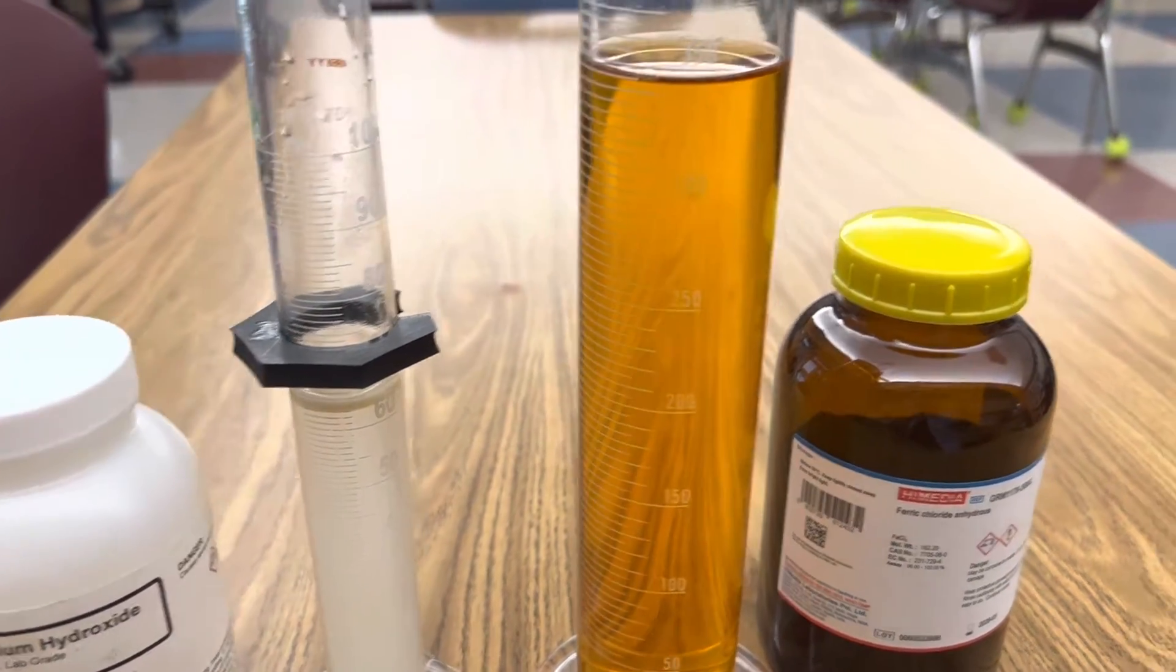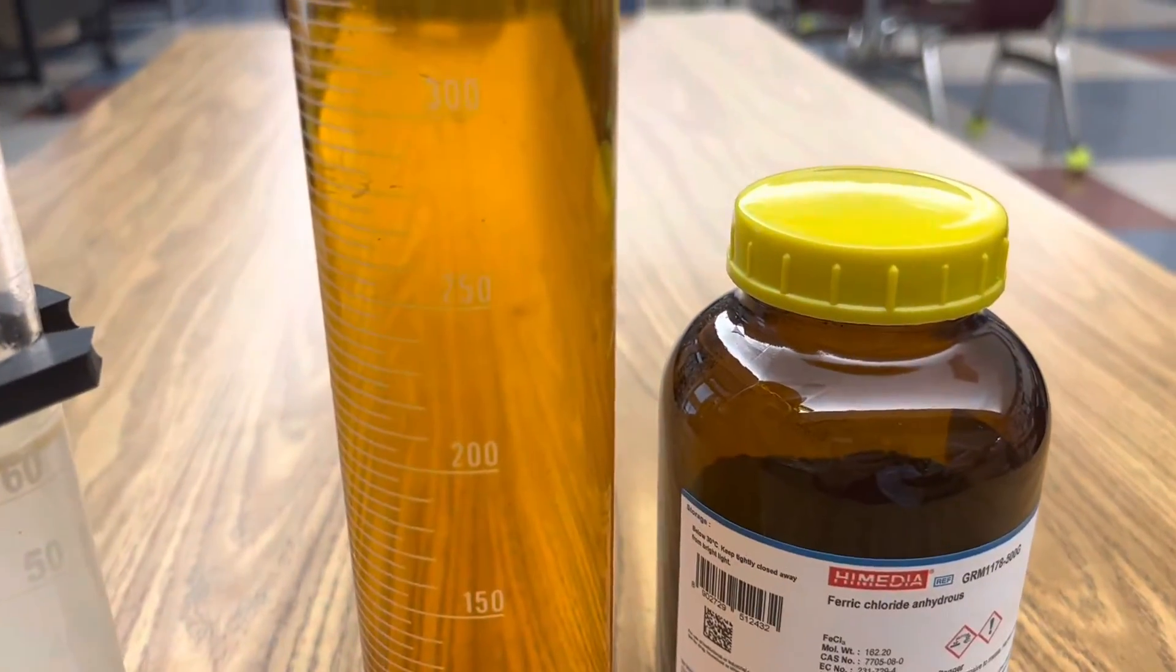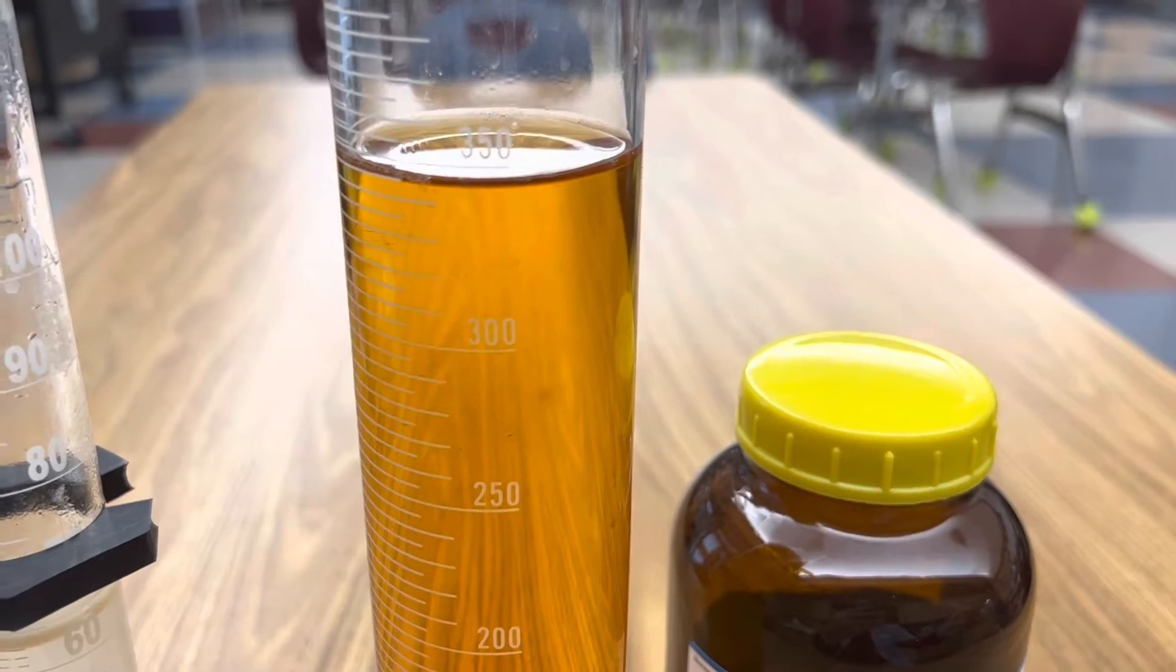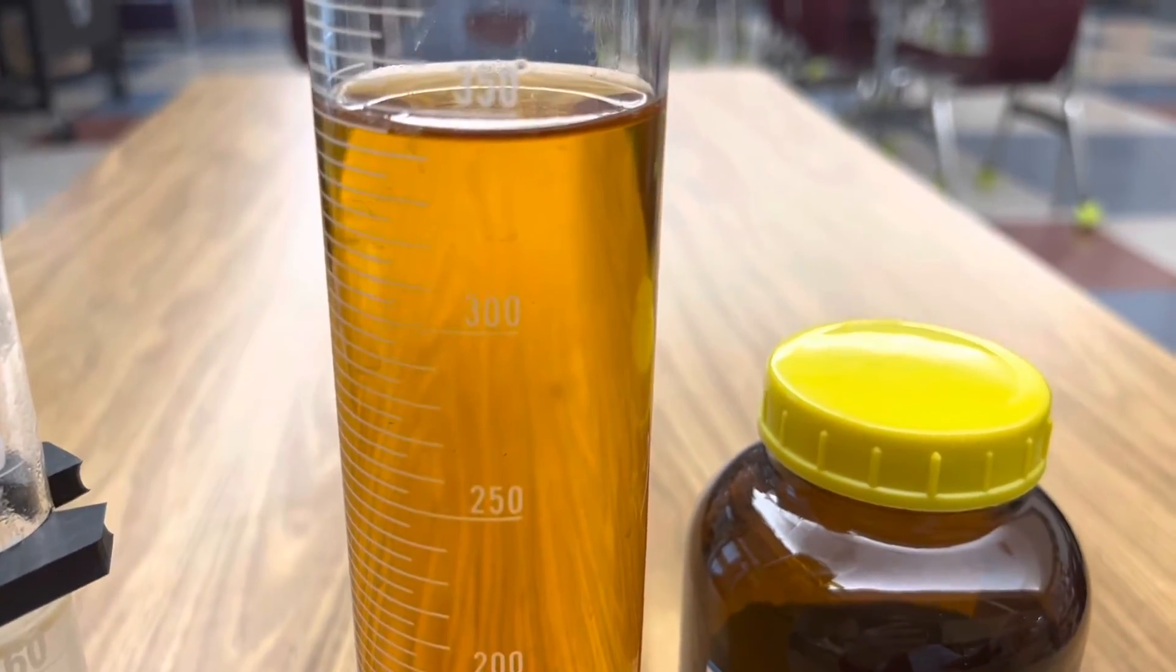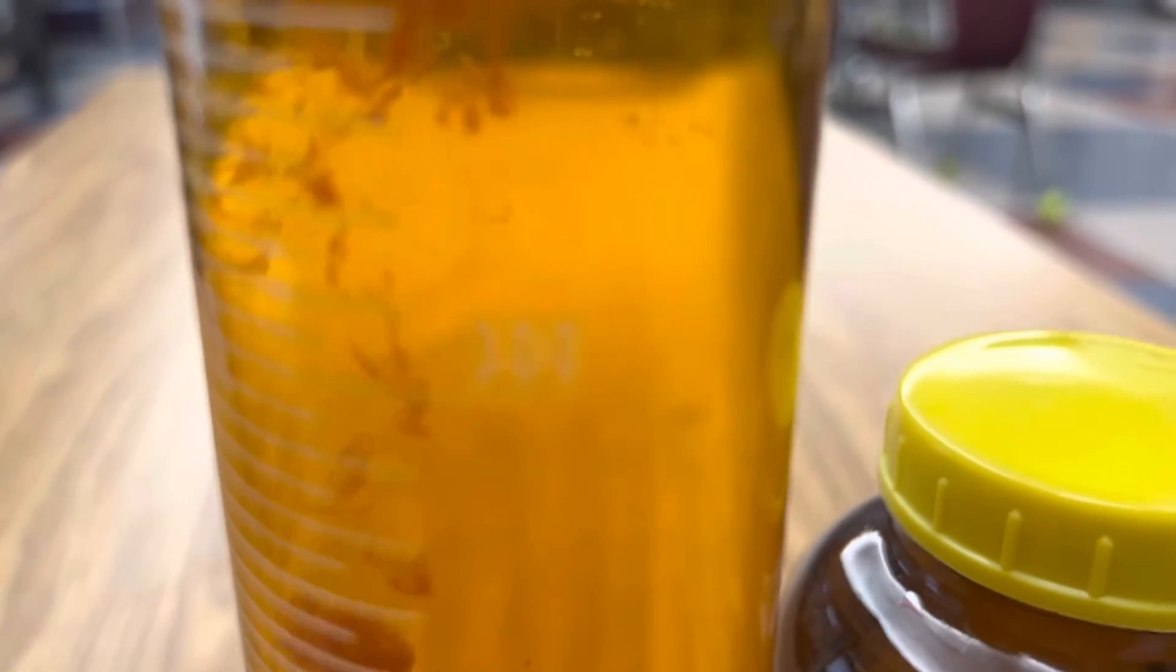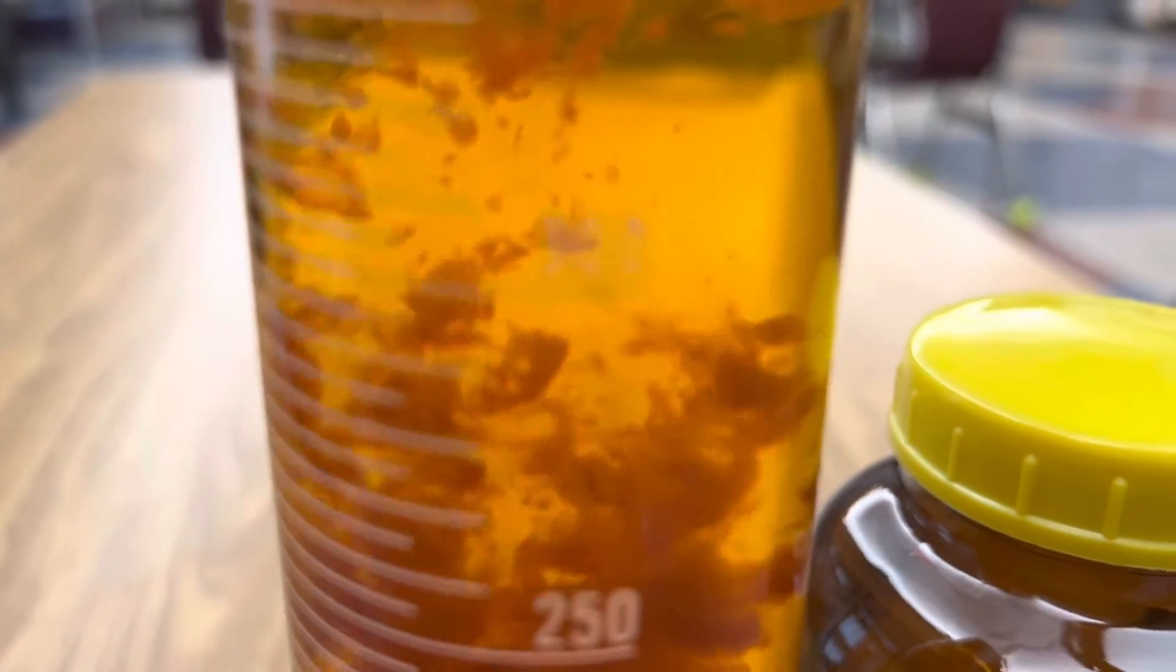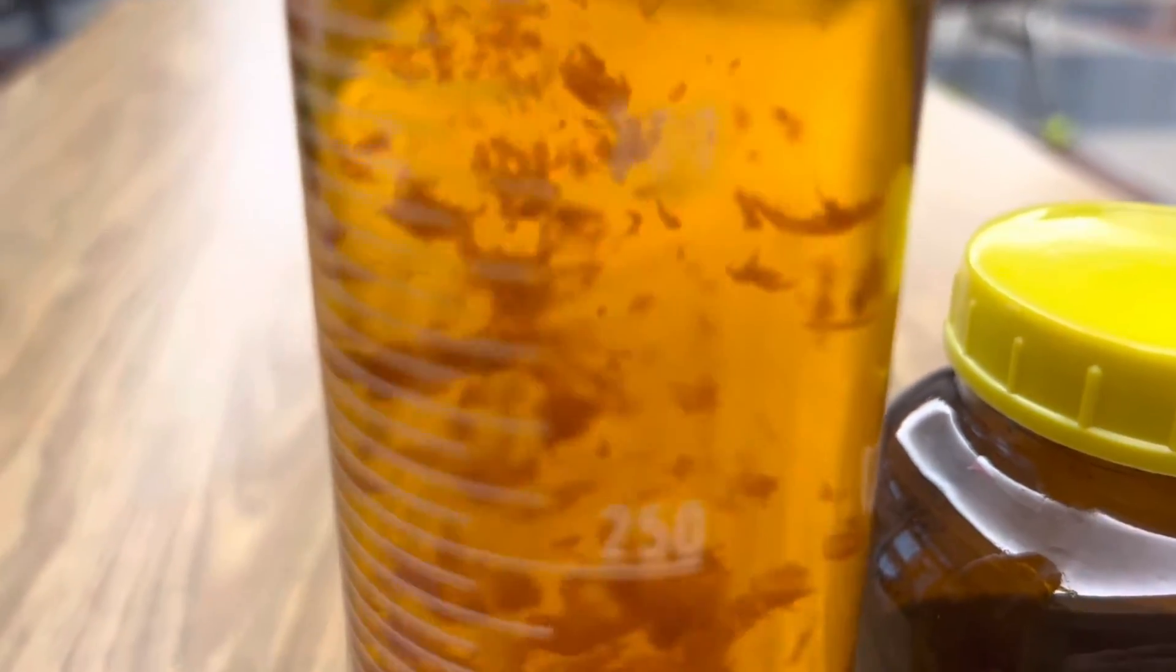Here's my solution of sodium hydroxide. You can see that it's clear. I'm gonna get close to my solution of ferric chloride and you will see the precipitation of ferric hydroxide. Here we go. Look at that. Here's a little more. Just awesome.